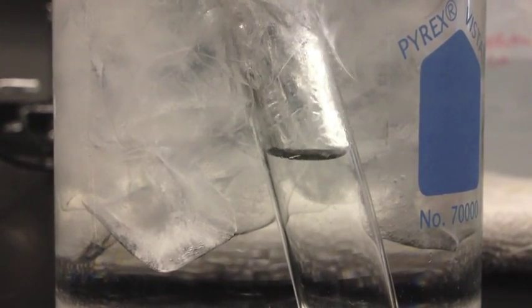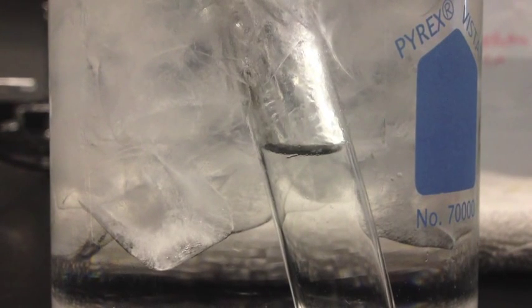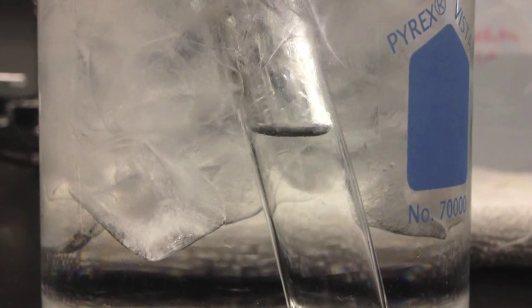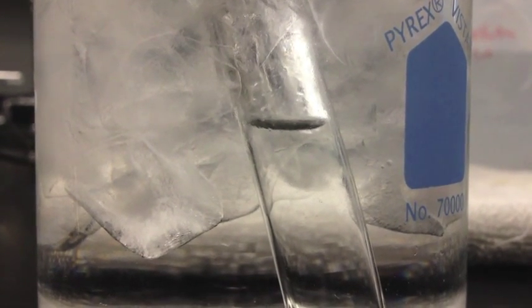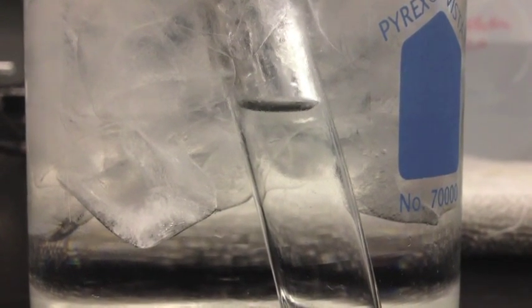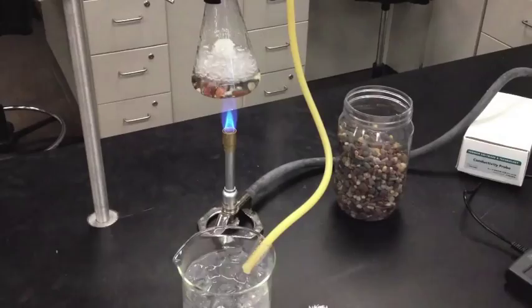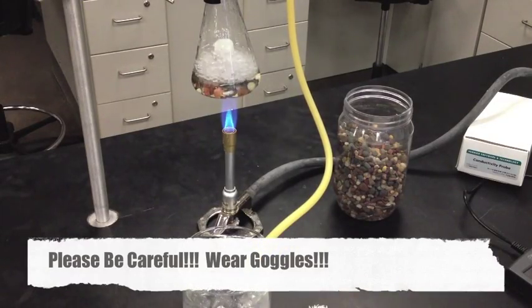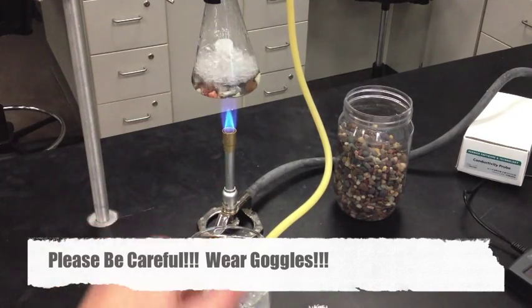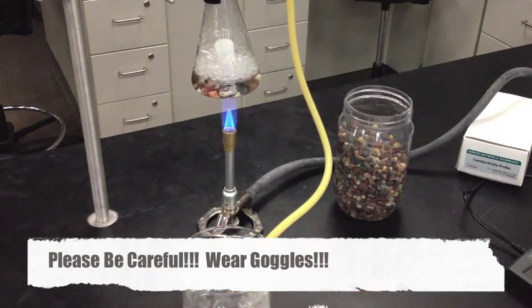You can see — zooming in on the test tube inside the beaker — that the level is rising. I'm collecting distilled water as it boils, slowly condensing the steam into water in the ice water bath. Please be very careful — this is a potentially dangerous situation. Don't get distracted; we've got very hot steam, boiling water, and a potential pressure situation if the tube gets backed up. Make sure you're monitoring this the entire time.